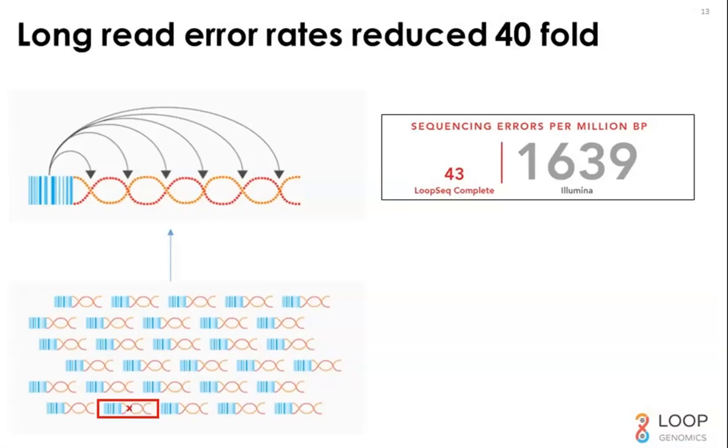So the answer is explained in this scheme here, where it shows that starting from the barcoding reaction, we have this barcode that's distributed intramolecularly to all the different parts of the molecule. And the end result in our prep is that for each UMI, for each barcode, we have generated a sort of cloud of short reads that collectively span the entire length of the 16S molecule. So typically for each position in the long read, we have multiple short reads that cover it.